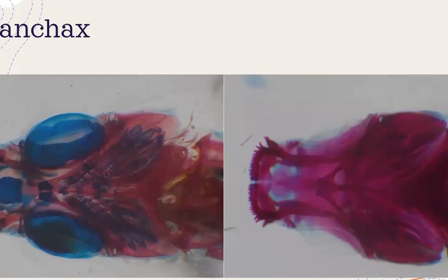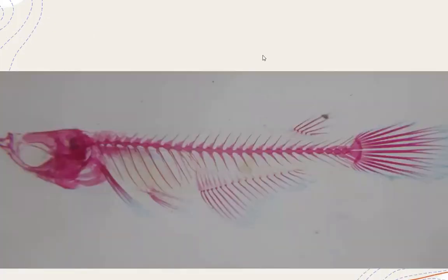But sometimes you can try not only one specimen. If you want to do, you can do around 5 to 10 specimens together. You can look and clearly understand the fish, because sometimes we have mistakes in an individual. And this specimen very clearly stains every bone, cartilage bone exactly. We can do that, but you should think about that.